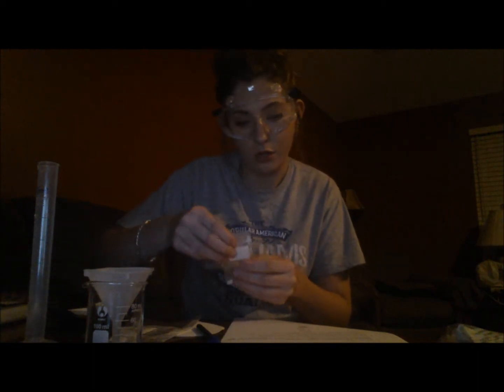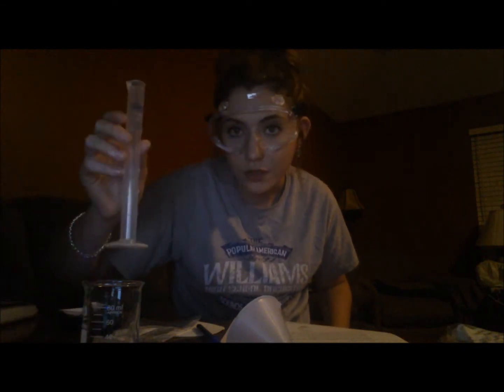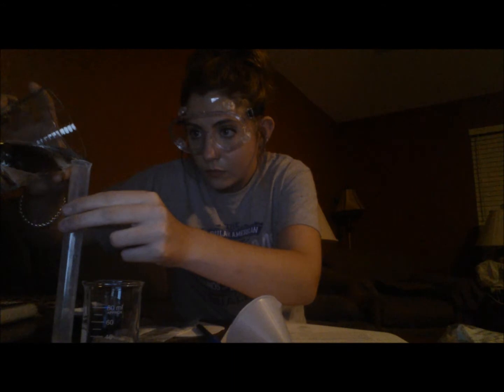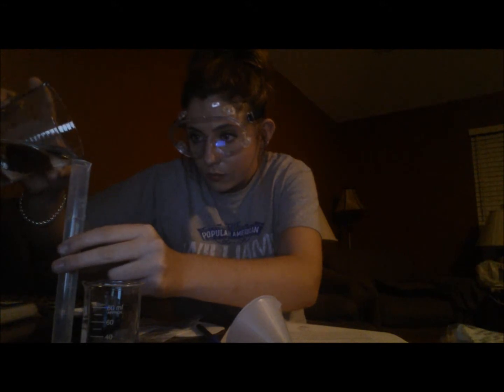Put it into the 100 milliliter beaker. So that's 1 exactly. Add 25 mils of distilled water. I'm going to use this graduated cylinder. Okay, so that's almost exactly 25 mils.